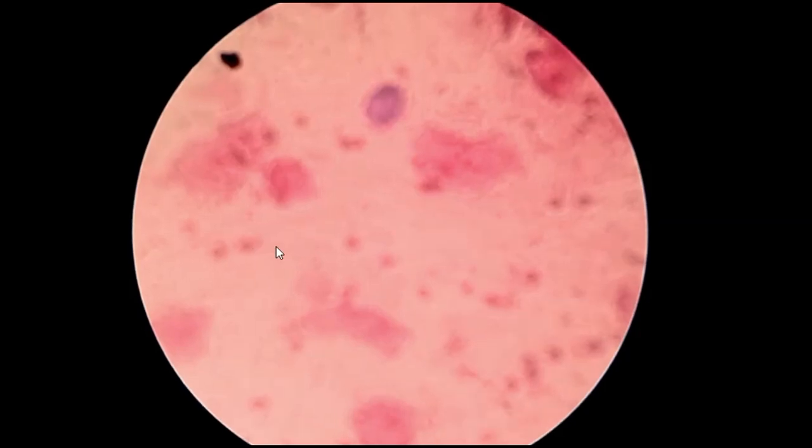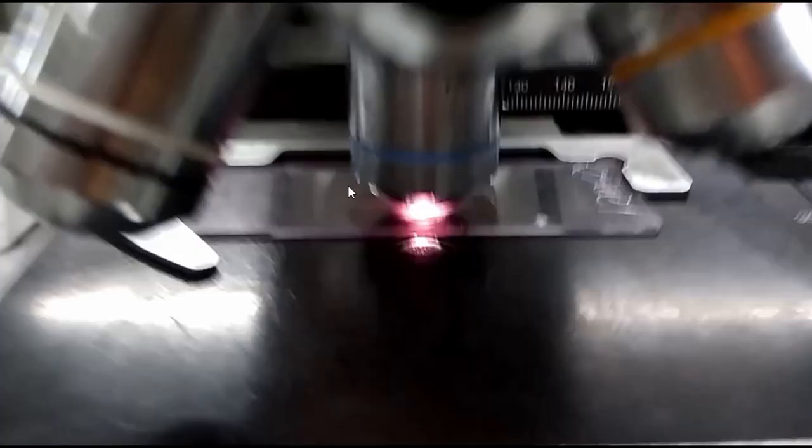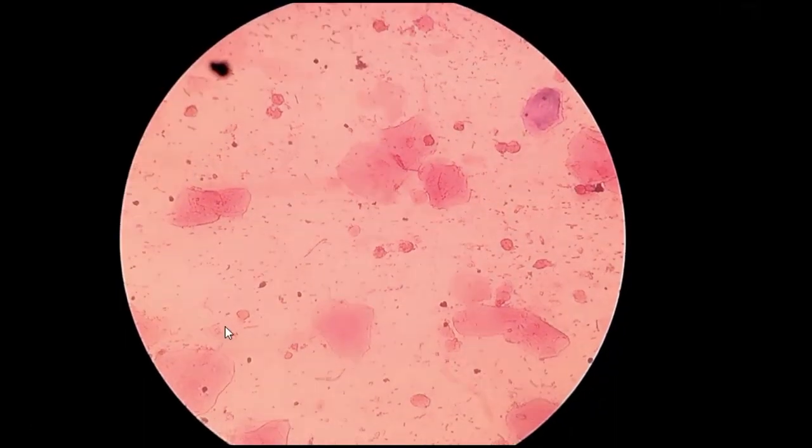Okay, so this is a blurred image, so you can use fine adjustment in this way. Yes, here you can see this. So this image is at the 40x objective and our eyepiece is 10x, so it is 400 times greater than its actual size. This one is the epithelial cell and this one is the pus cell.